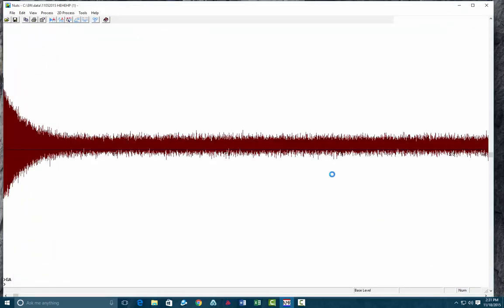Before we start doing any processing, this is an array of data, so we have to enter arrayed mode. So down here in the bottom left hand corner, I'm just going to type the command AR, and if you look over here in the bottom right hand corner, you'll notice that it says now complex arrayed, so that we're in arrayed mode. That means anything we do to the one that's currently on the screen happens to the whole array.